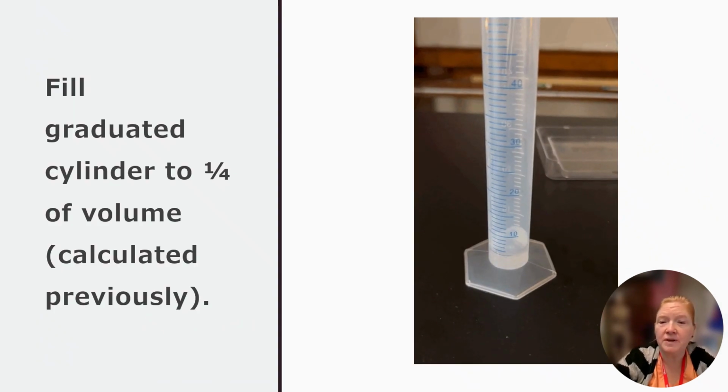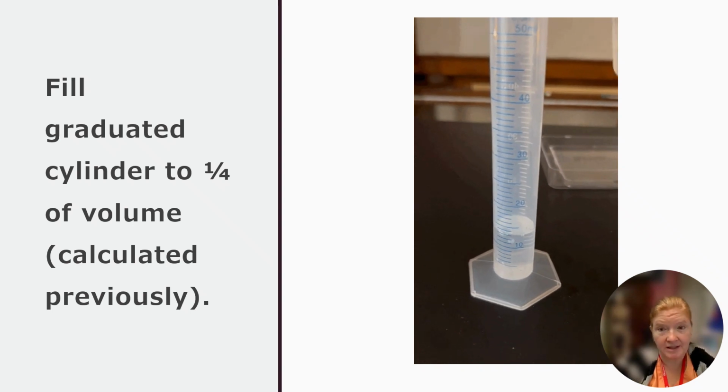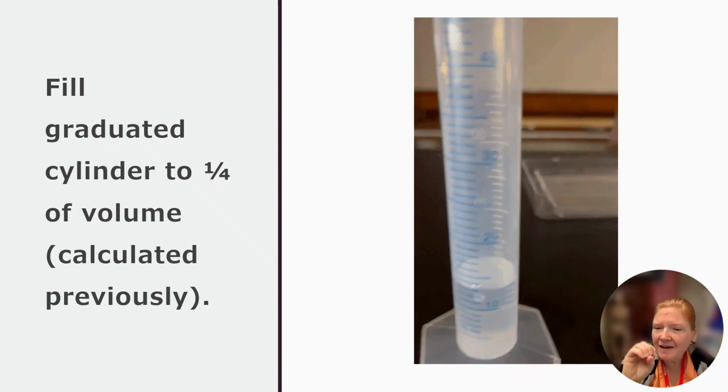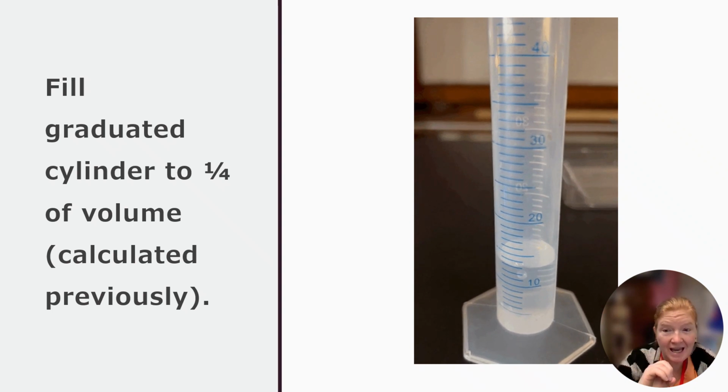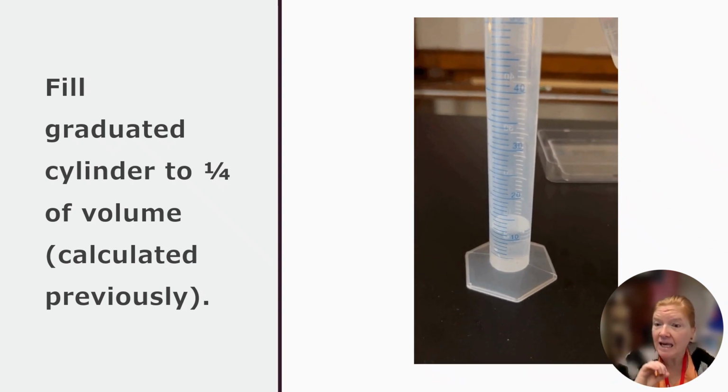Now you're going to fill the graduated cylinder to a quarter of the volume. Remember, we calculated that already. Now, it doesn't have to be super exact, but it's going to be close to that. But again, it doesn't have to be exact.